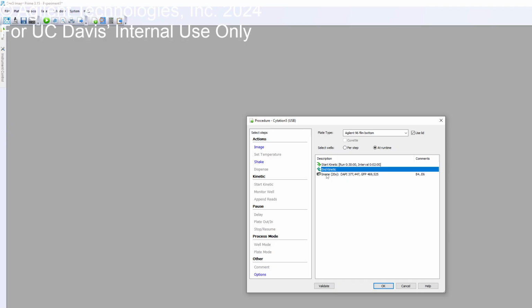Did you want to treat one well at a time, or did you want to treat your whole plate at the same time? Yeah, every well should have a different treatment, at the same time, theoretically. Okay. You can also look at the minimum interval time, how much it is taking for the instrument. You may not be able to collect the whole plate images because, as I said, whole plate imaging will still take about 3.5 minutes, which is one channel. But you can do half of it, or a partial plate. Depending on how much time it takes, you can change those.